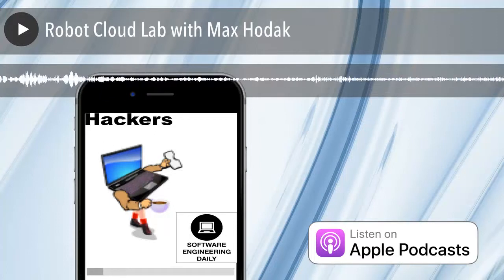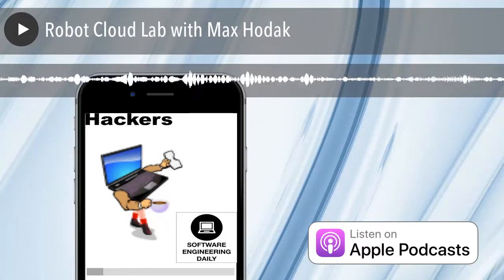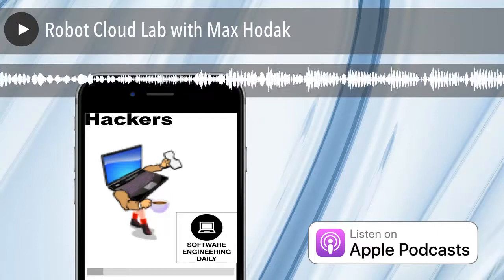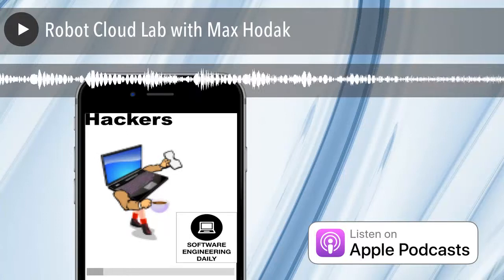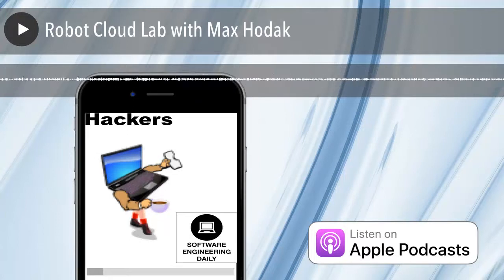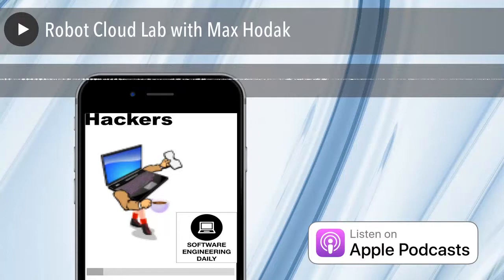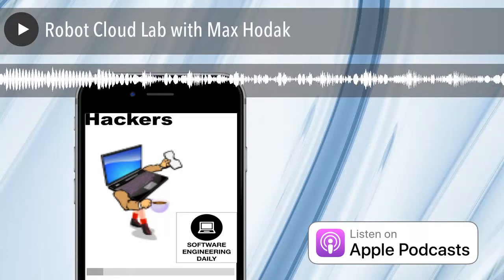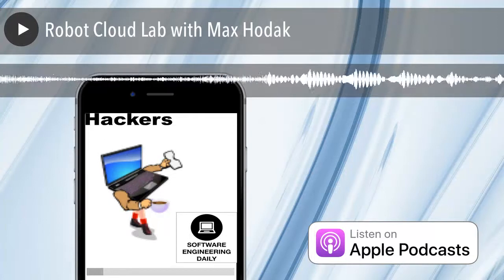So this is a classic, expensive sampling problem where you want to think about things like Bayesian optimization and deep learning. One of the drawbacks of deep learning is that it requires a lot of data. So you have to get much smarter, with things like the more recent advances in one-shot learning, or finding other ways to bootstrap or augment your data set. And some of this is cost. One of the best ways to bring down the cost to generate larger data sets is to bring down the sample volume, because a lot of the cost here is not necessarily the cost of the devices or the robotics, it's the cost of the reagents.